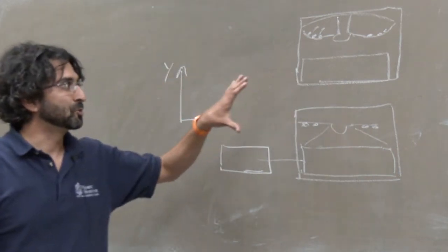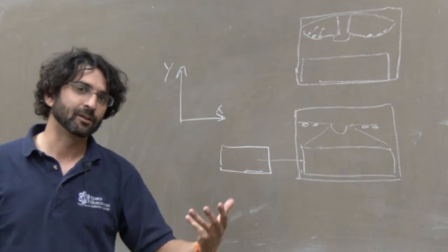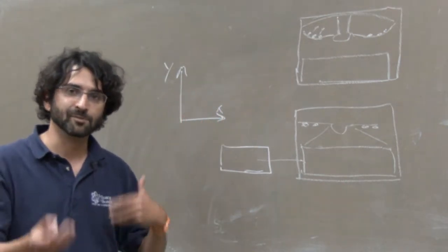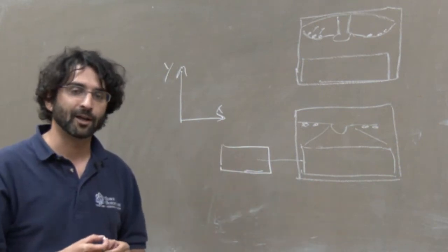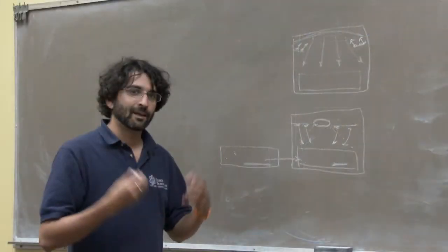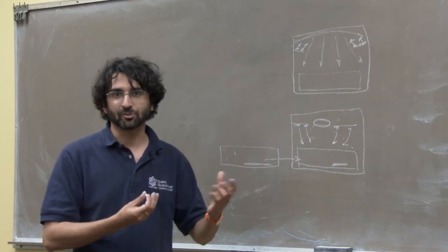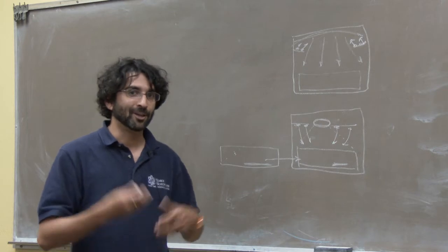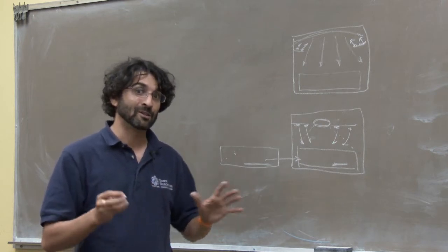And so in order to have the unit not warm up, we actually used software to integrate with the hardware that turns on and off the cameras at times, such that it doesn't get too hot in that. And that took extensive lab trial as well to see how long we can record before it gets too hot. The final constraint was to make it efficient and quick for the astronauts to remove the cassette, change the food, and put it back. Do you think we went with a solution that involved screwdrivers and a bunch of screws? No, we went with something little.